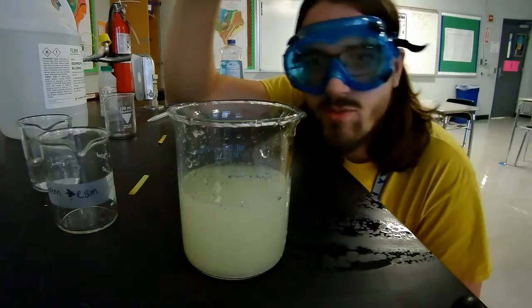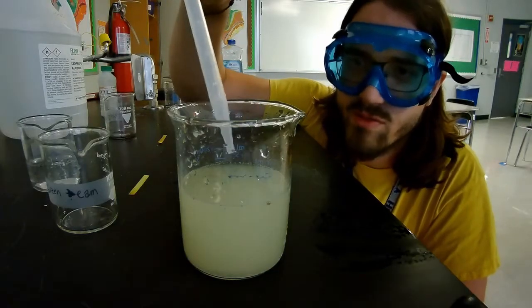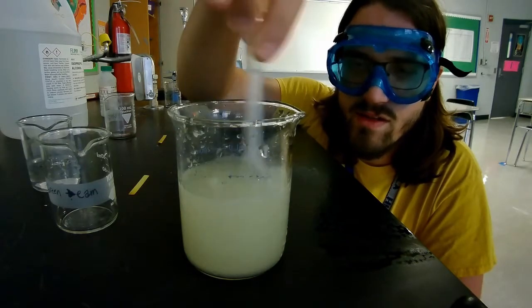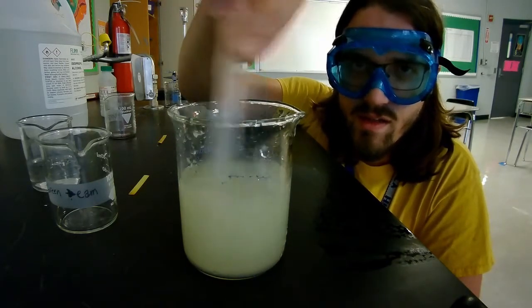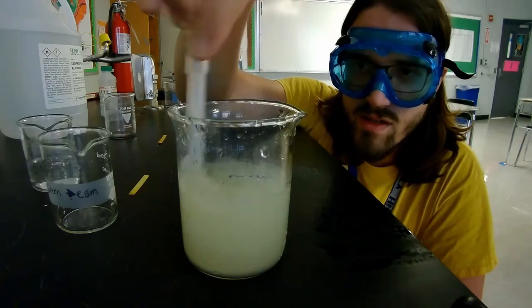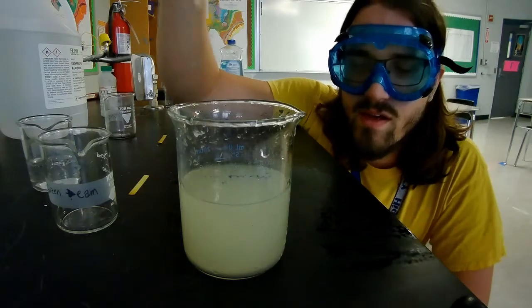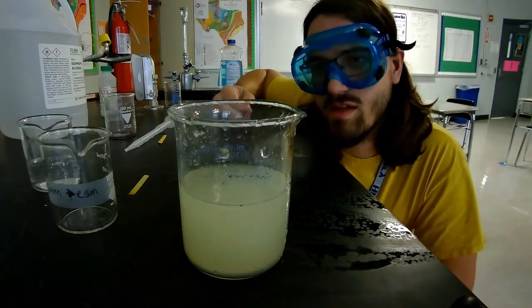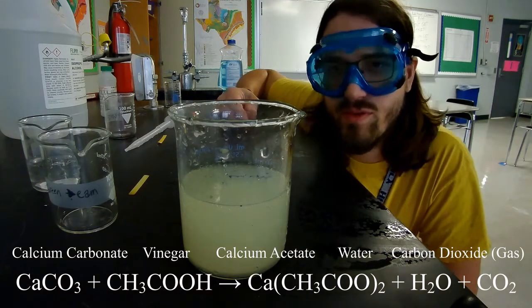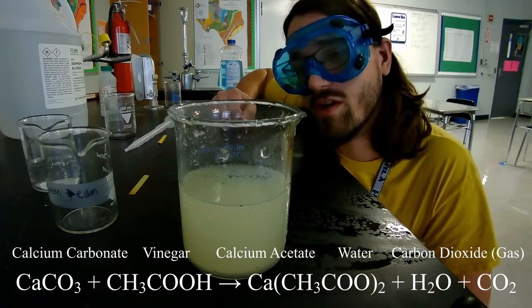Well, we saw a kind of similar, I hope that picked up on the camera. There was a bit of fizzle there, but it was kind of weak compared to our strong base and strong acid. So a similar reaction, and you can hear it sizzle there. As I stir it and move these molecules a little bit closer together, you can see and probably hear a little bit of the fizz. That is pretty typical of chemistry. If you have strong acids and bases, they're going to be more violent in terms of their reaction compared to weak acids and weak bases. But we still got a little bit of a reaction.